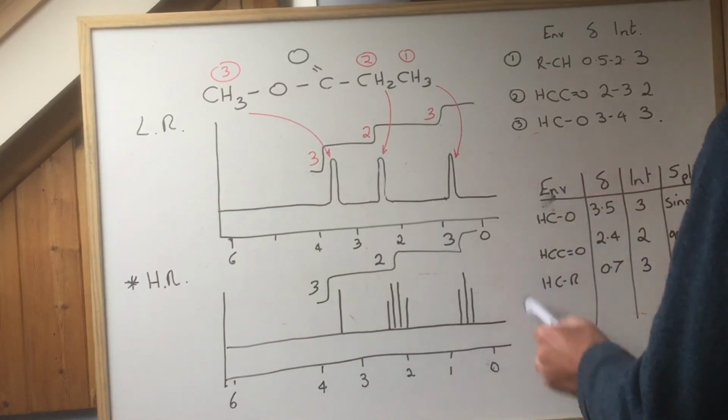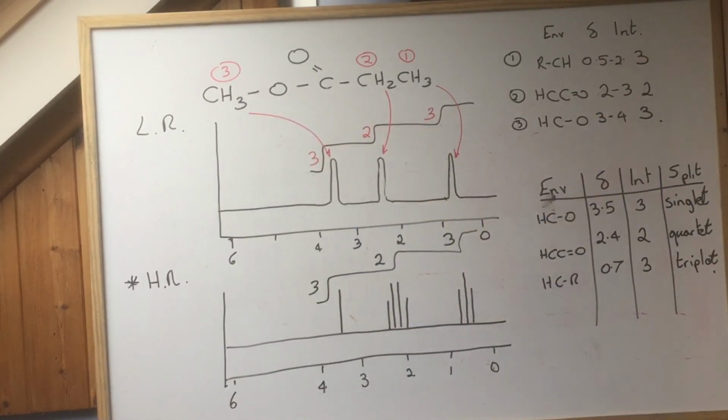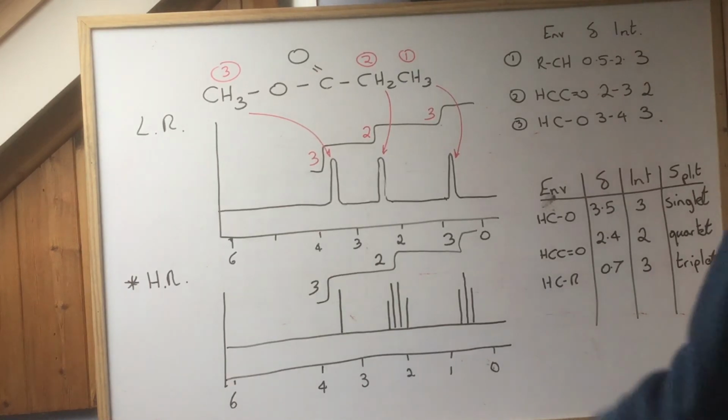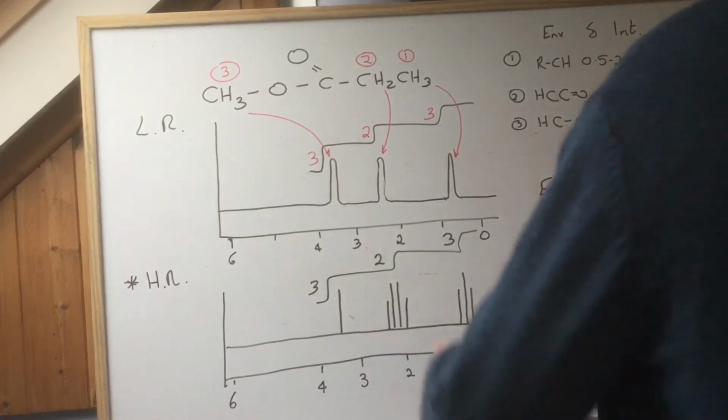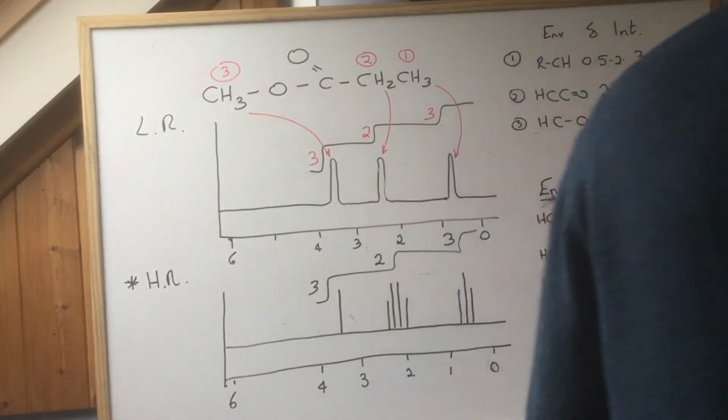So from that table I should be able to deduce that molecule with a bit of other information as well. But there's your splitting pattern right there. That's what it's all about.